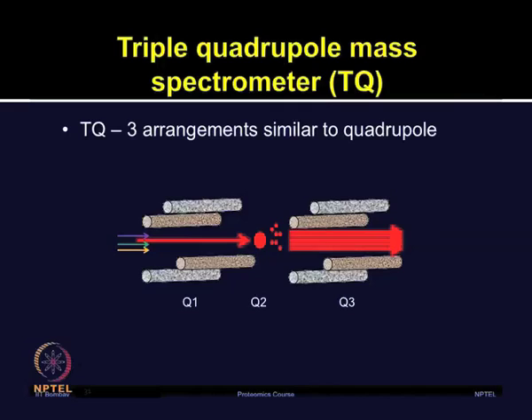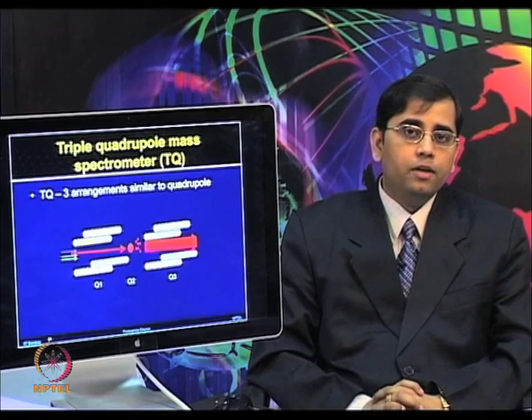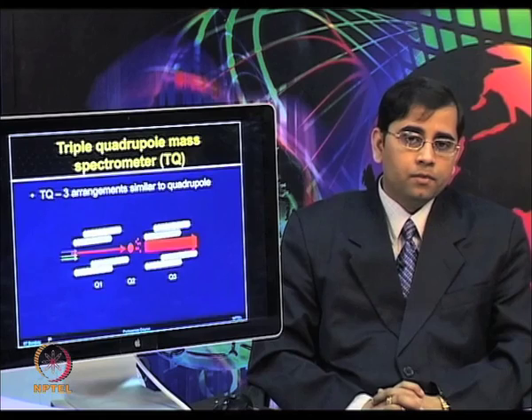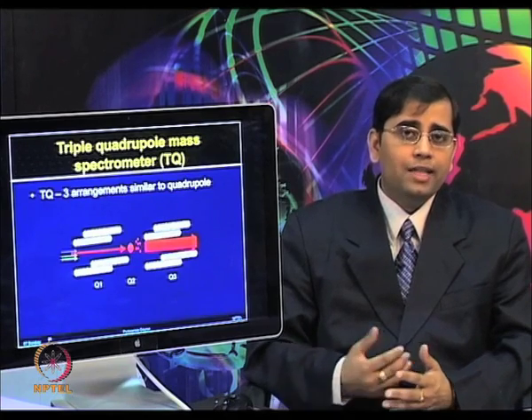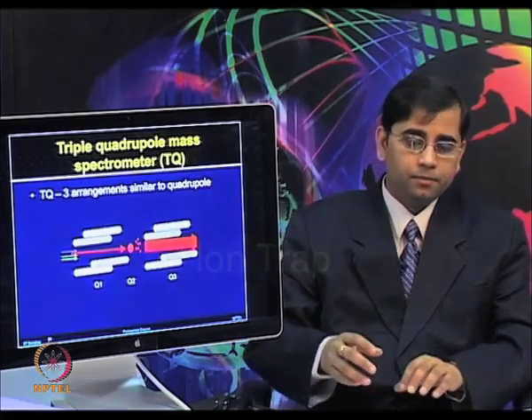Q3 scans the stream of ion fragments which are emerging from the collision cell to generate a collision induced dissociation spectrum. The mass spectrum of fragments derived from one peptide is obtained after one analysis is complete. Then Q1 directs a different intact peptide into the collision cell. So, in this sequential manner, it can process various peptides.